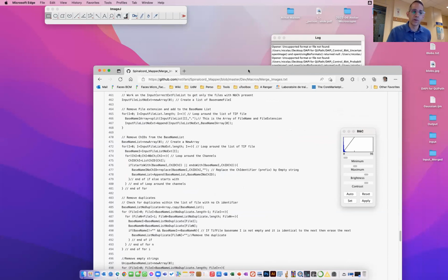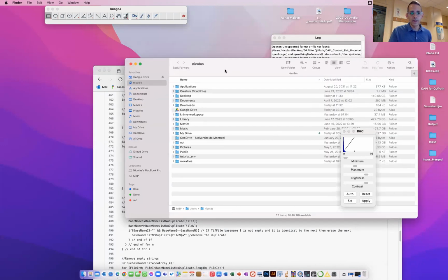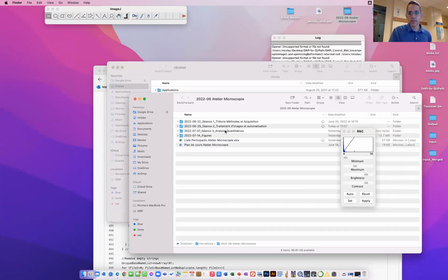And I wanted to make it work for a lot of people. So that was one example from Florence, who was telling me she wants to do that. Maybe one exercise was coming from someone called Lydis. Lydis told me she has some files and she wants to segment them.